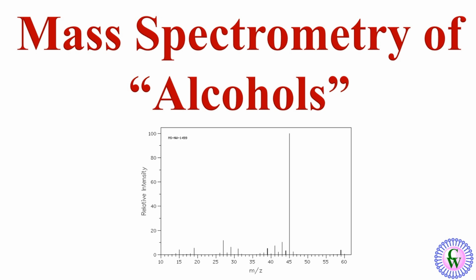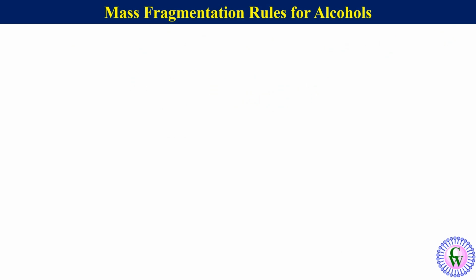In this video we are going to learn mass spectrometry of alcohols. We will learn how this technique provides unique insight into their molecular weight, fragmentation pattern and structures. We will first go through basic fragmentation rules for alcohols.